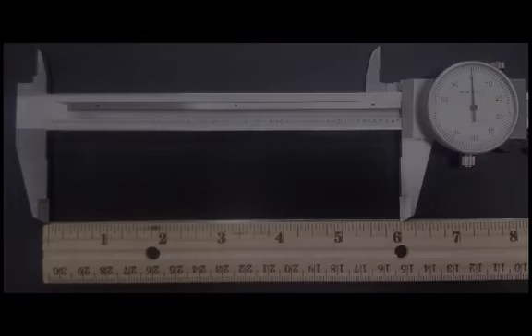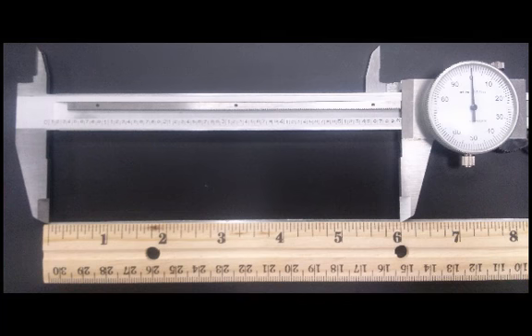Let's take a look at how the calipers can be used to make a measurement. I went ahead and set the calipers to 6 inches.